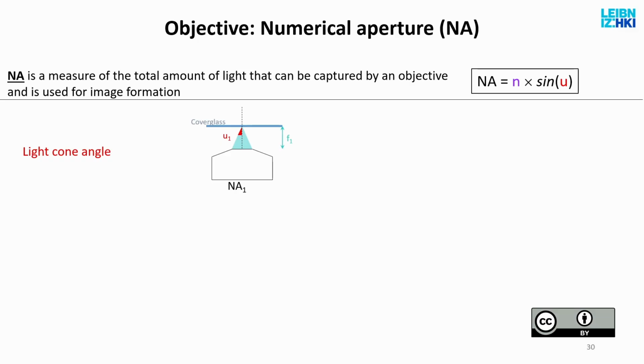And here there is a metal, like brass or aluminum or stainless steel, cone within which this lens lives. Then there is a maximum angle at which light will be able to enter the lens. Anything above this angle will hit the cone and will not enter the objective. So this means that if I measure this angle, plus I know the refractive index of this part here, I can calculate the resolving power of a lens.